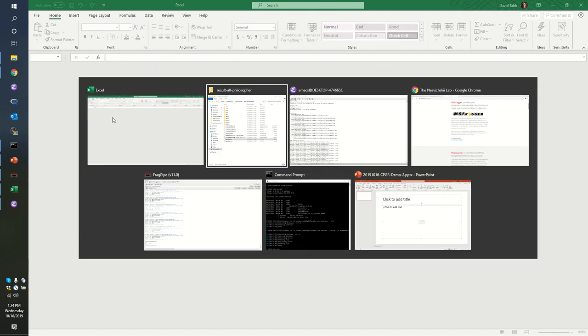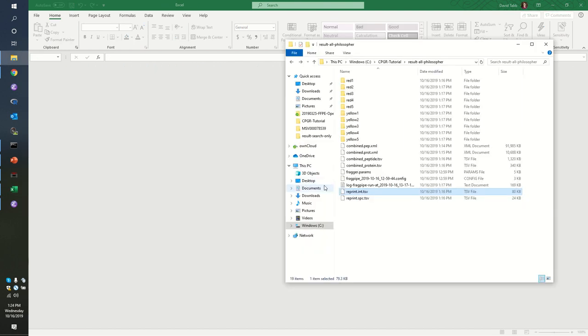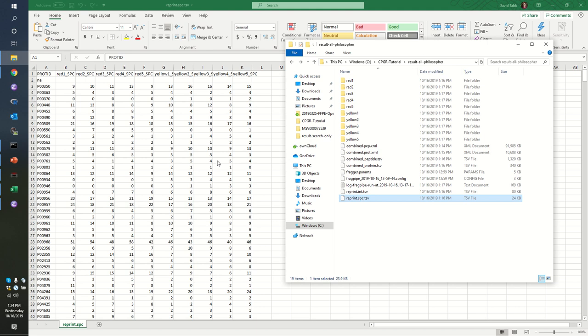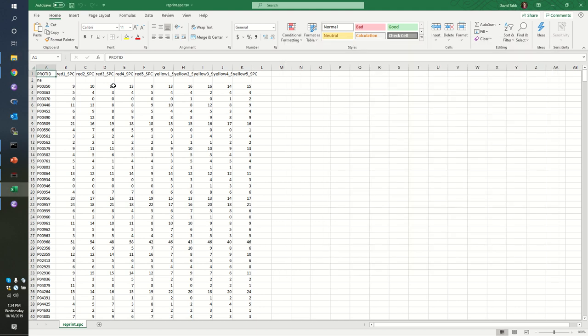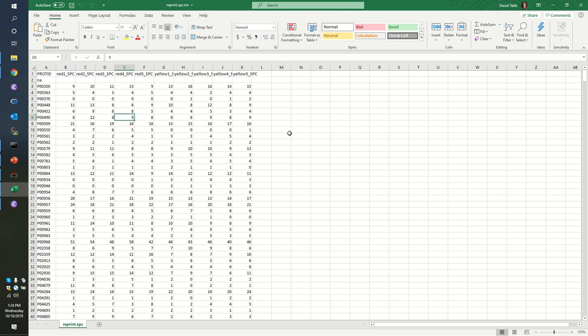So that's not so very helpful. But let's open up the SPC table. Frequently, you will see SPC used in proteomics to represent a spectral count table. This is the same kind of table that we saw in the pivot table produced in IDPicker earlier, except now we're probably doing so with a slightly higher sensitivity of identification. The descriptions didn't make it in here, but if you've got a web browser open to Uniprot, you're going to be able to look them up just fine.